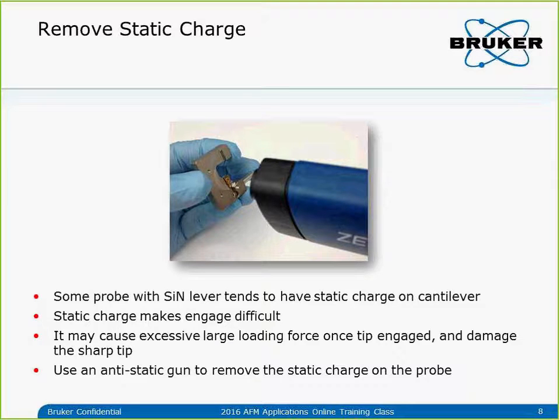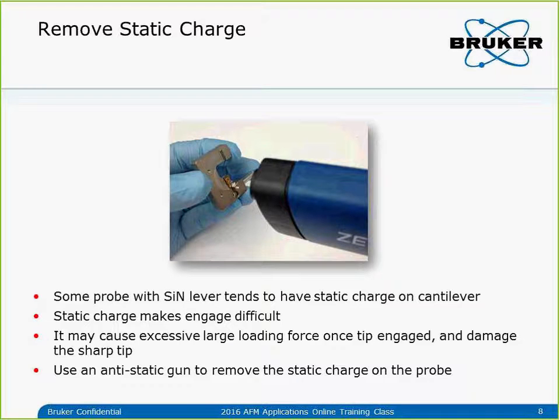You will see the cantilever deflection signal keeps changing, making engagement very difficult. If it does engage, the static charge may dissipate, causing the force loaded on the probe to be much higher than expected. This will damage the sharp tip and if the force is too strong we cannot get atomic resolution. So we need to remove this static charge. A good way is to use an anti-static gun — hold the holder, point at the cantilever, and squeeze the trigger a few times. This very effectively removes the static charge. The anti-static gun is inexpensive — you can find it on Amazon for less than a hundred dollars. If the sample also has static charge, you can use it to discharge that as well.